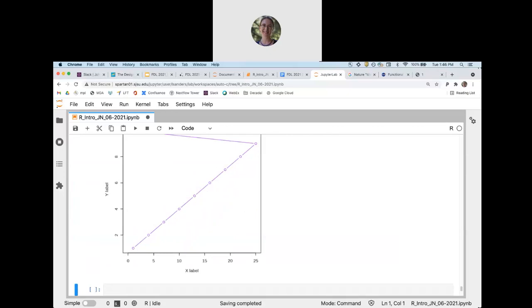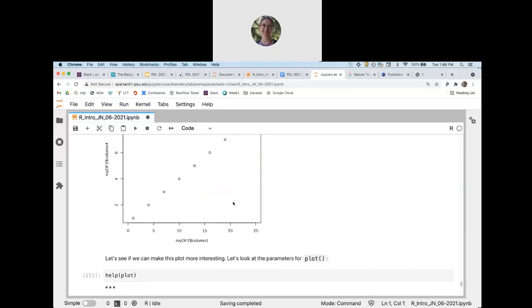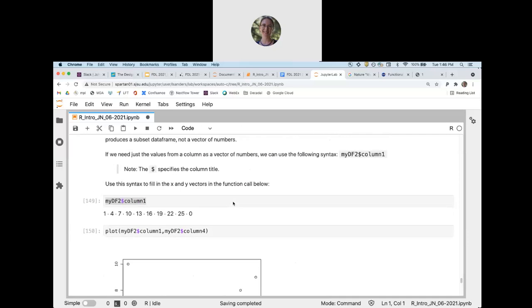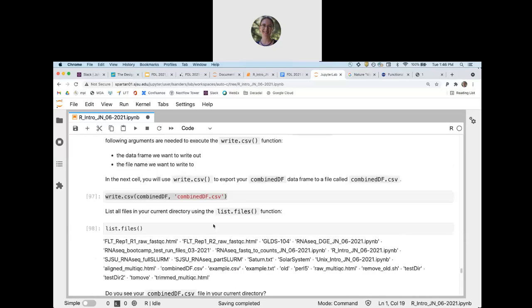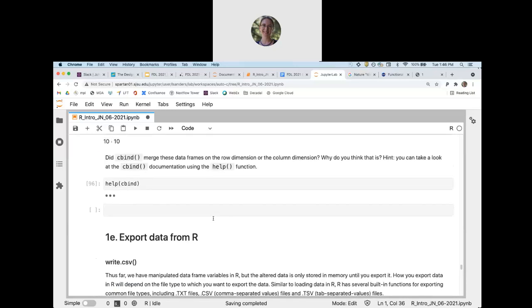Okay, so if we do, for some reason, want to rename a column, let's go here. Okay.